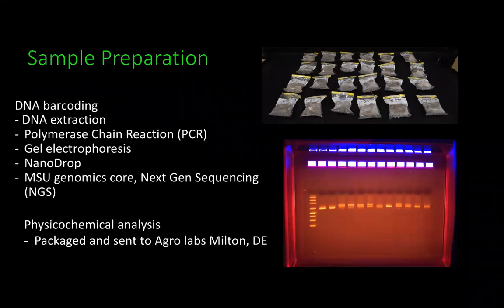We sent these off on dry ice to Michigan State University Genomics Core for next generation sequencing. They're going to take these genetic markers, tell us exactly what the sequence of those are, and then send the information back for us to process.